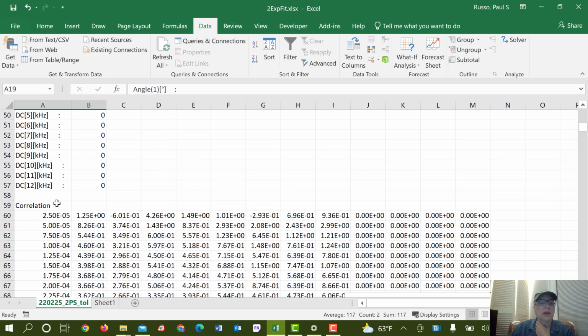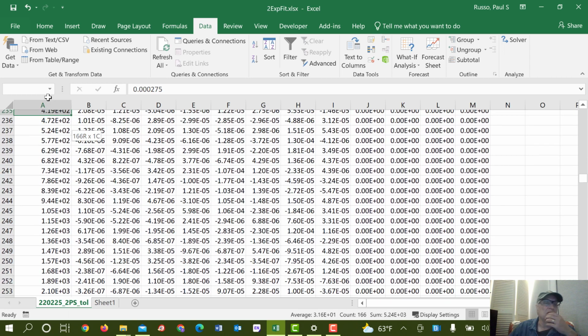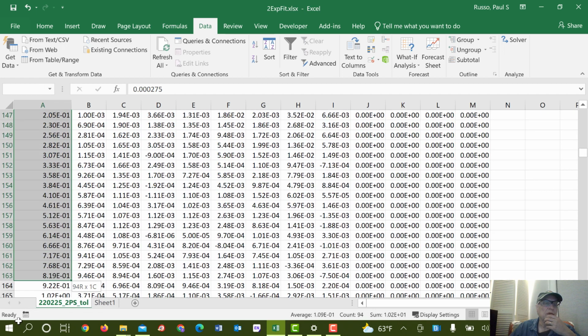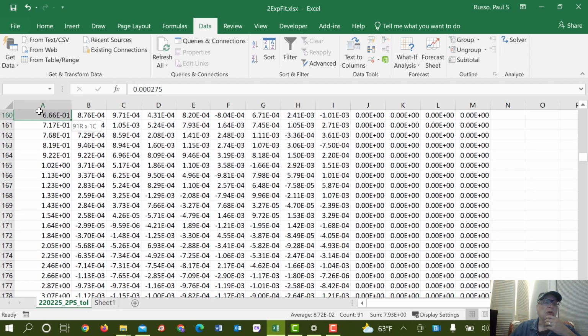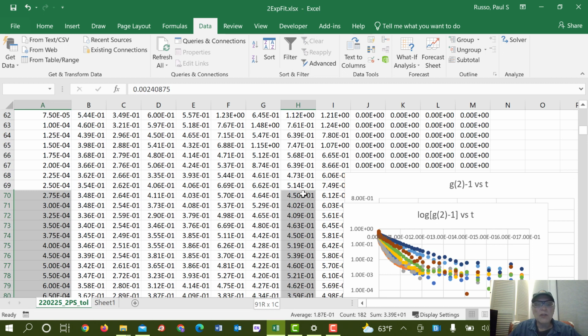So we're going to get the lag time data from, we said, 70 to 160. Okay, and there's really no reason why it would be the same for all different angles except as a sort of convenience. It really isn't. But if we're doing things right, that shouldn't matter too much. It's not exactly optimized. There's a lot of things you could optimize here. And we want the second to the last one, so I'll hit a control there and take up to the same level to 70.